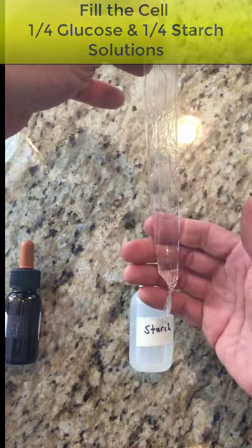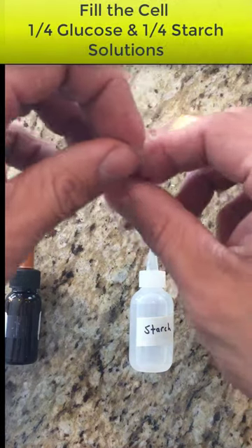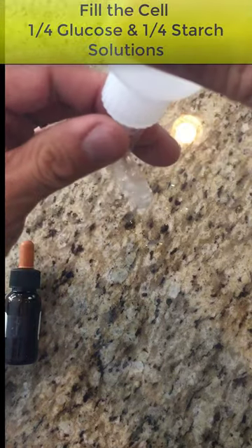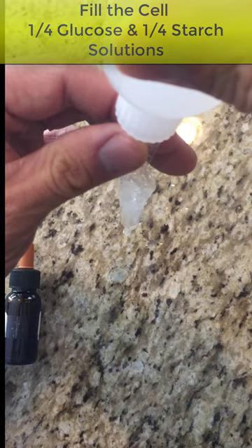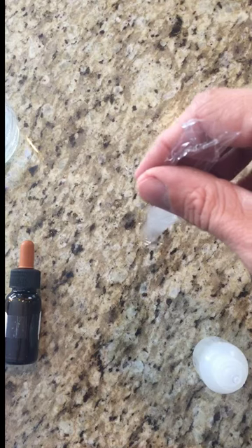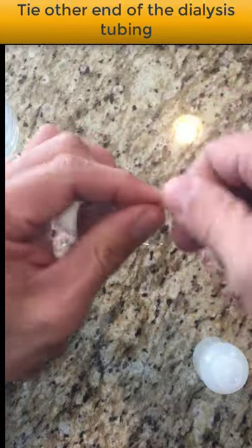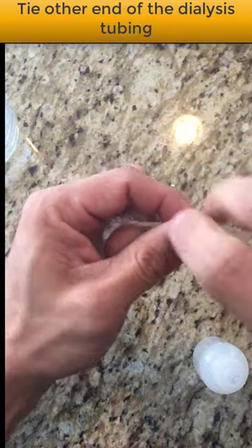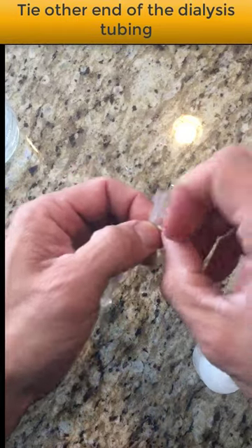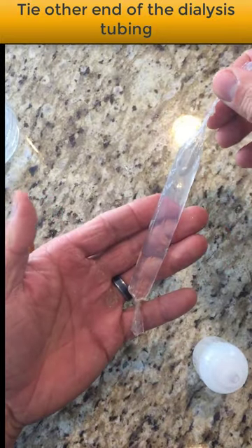That was step three. The other part of step three is to add the starch solution into the cell. Take your starch solution from the designated bottle and squeeze it in until the tube is about halfway full. Then for step four, squeeze the air out and tie off the top of the tube the same way we did the bottom — twist it nice and tight so none of the solution leaks out. Your cell should look like this.